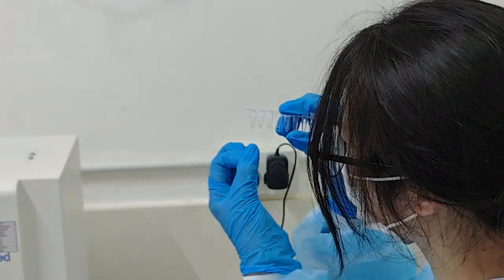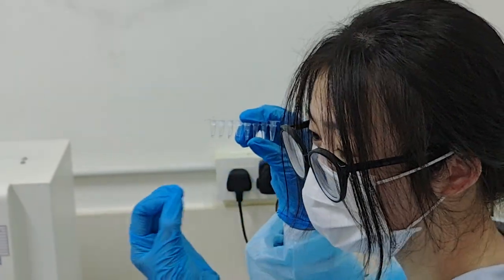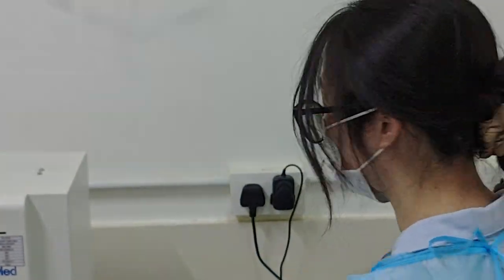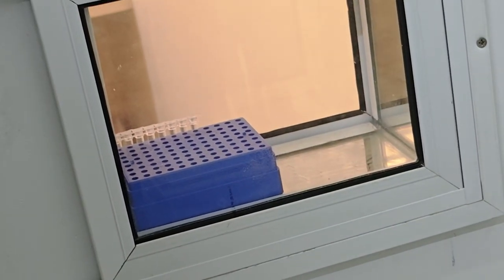Yes, you can see a little bit strong, a little bit, and the bubbles will burst out. And then centrifuge again.